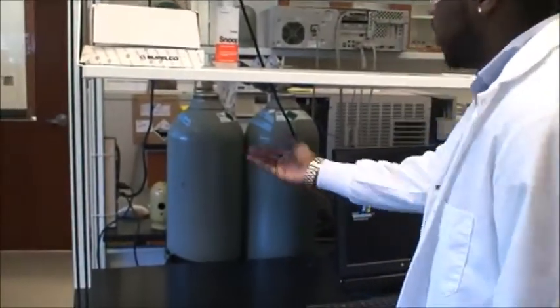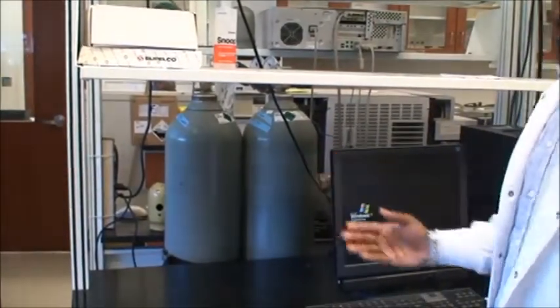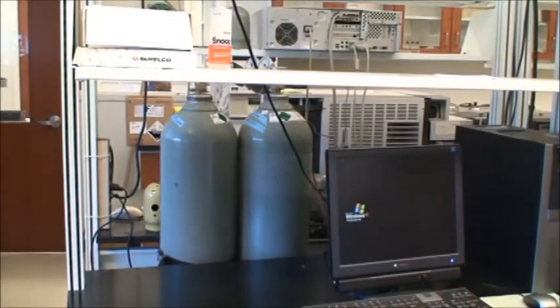GCMS is actually a combination of two different instruments: one that focuses on gas liquid chromatography and mass spectrometry. GCMS machines actually start with this important factor here, the carrier gas. This specific GCMS machine uses helium.